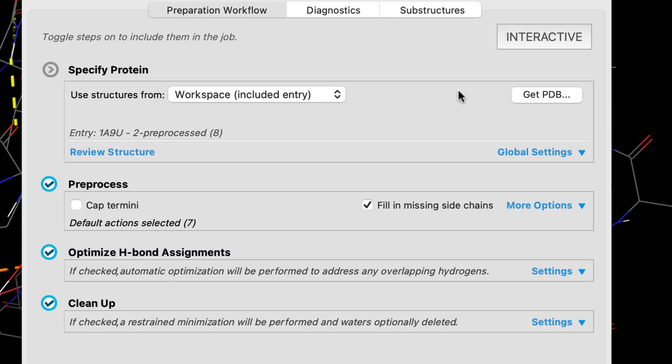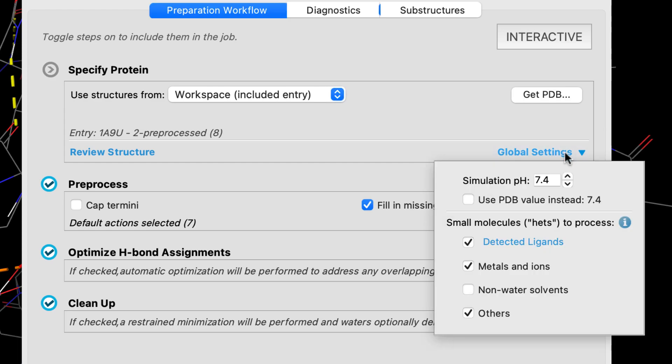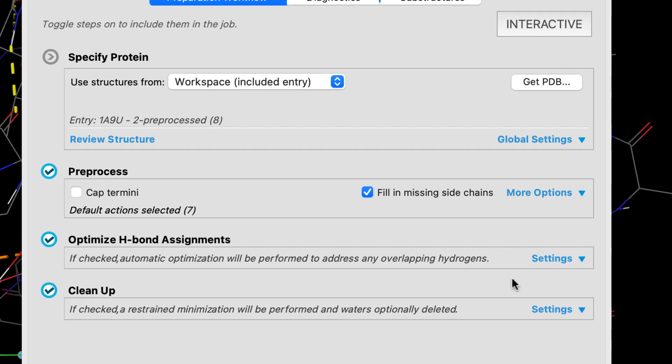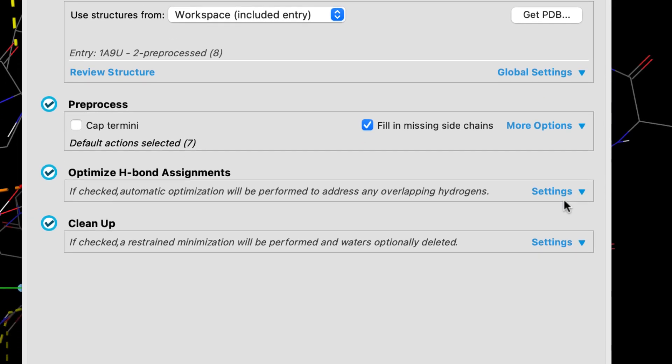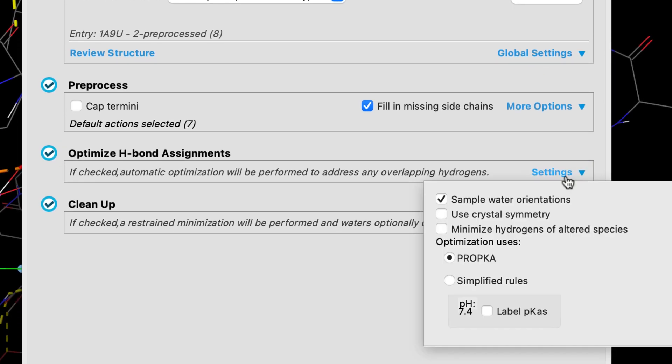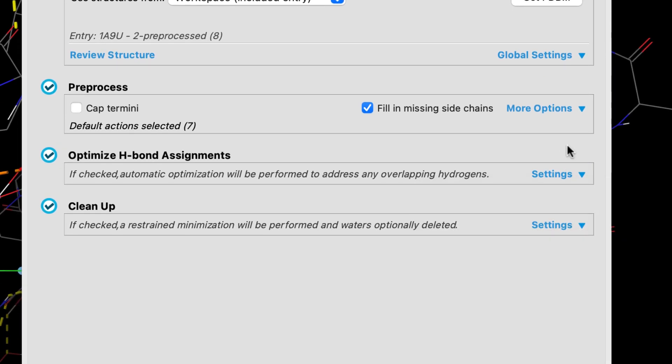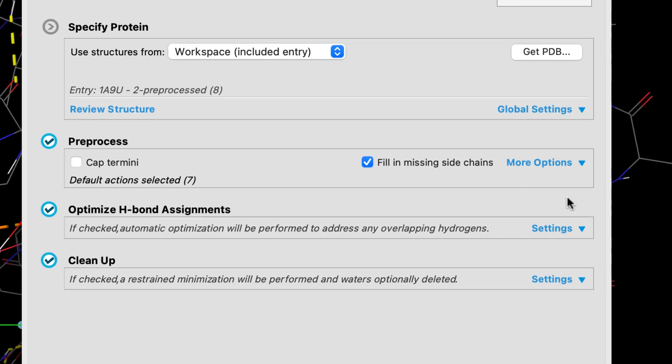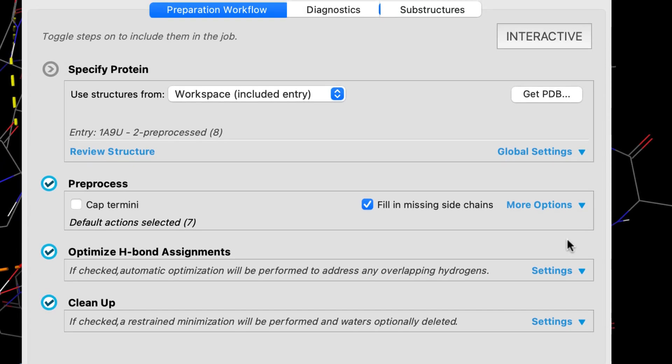All preparation tasks, including selecting from ligand states and optimizing hydrogen bond states, are front and center, making it easy for novice users to produce well-prepared proteins that will result in better predictions.